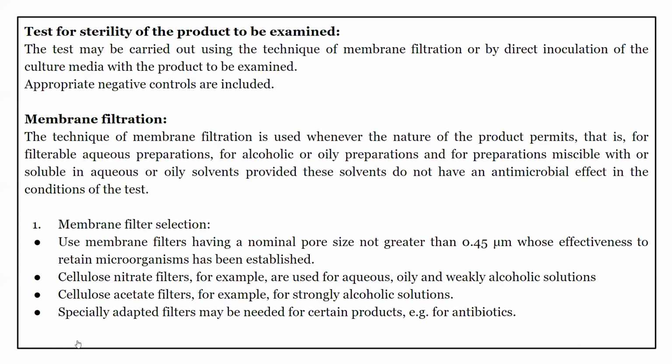So membrane filtration will be the method of choice for the liquid formulations, either aqueous or alcoholic or oily preparations, so that they get filtered through membrane filter paper, and the microbes will be retained onto the filtration medium, and the product will come down from the filtration medium. So that is the criteria.